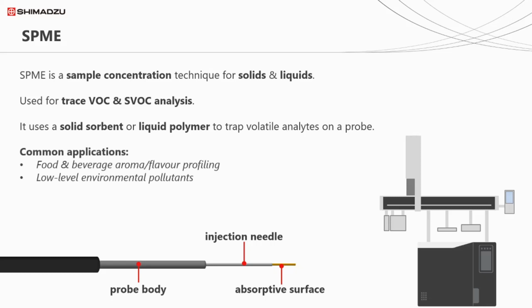It's not a hugely common technique, but has applications in food and beverage aroma and flavour profiling, where extremely low concentrations of compounds can significantly impact taste and smell. It's also used in some labs for very low-level environmental pollutant analysis.